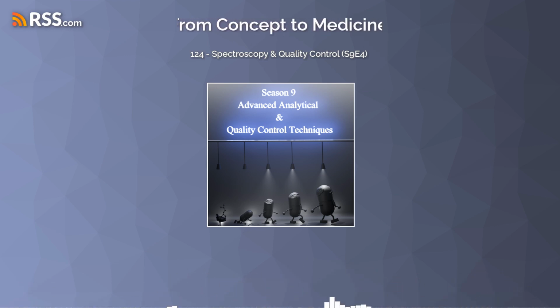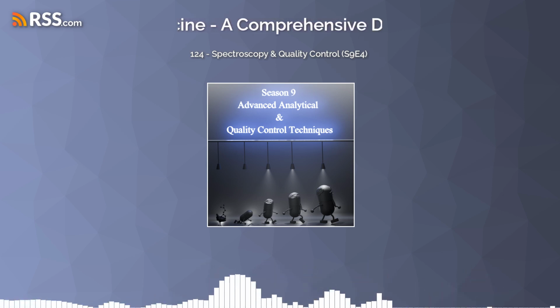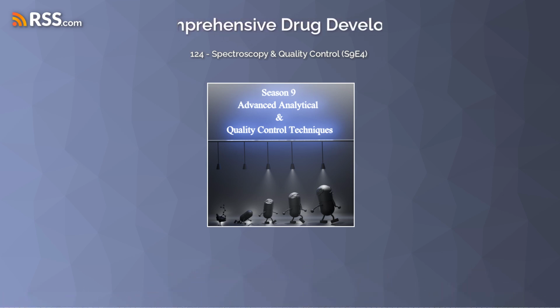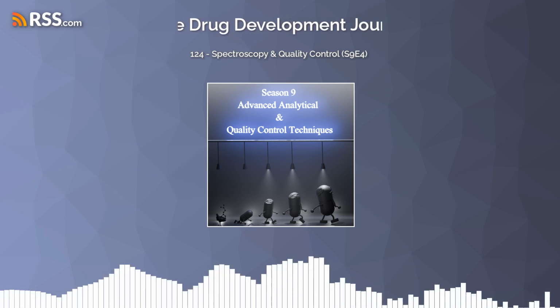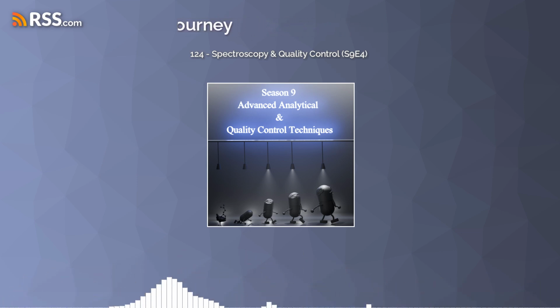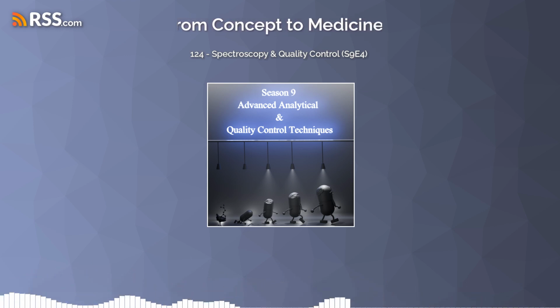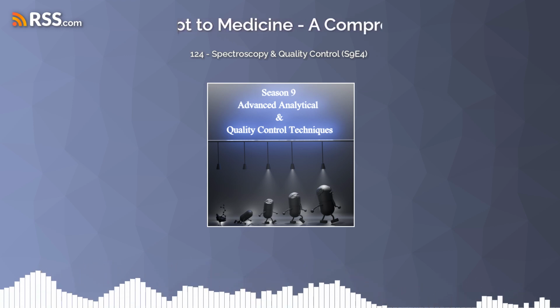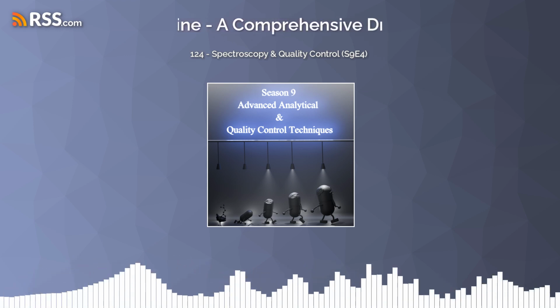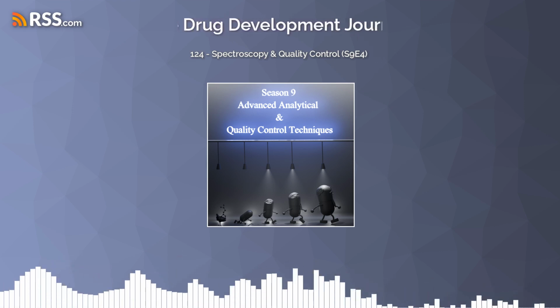Let's start with UV-Vis spectroscopy. I think this one, a lot of people, maybe they've heard the name, but maybe they're not exactly sure what it is. So UV-Vis spectroscopy, or ultraviolet visible spectroscopy, is based on a pretty simple principle. It looks at how molecules absorb light in the ultraviolet and the visible parts of the electromagnetic spectrum. The amount and the pattern of that absorption is unique to different compounds, and it's related to the electronic structure.